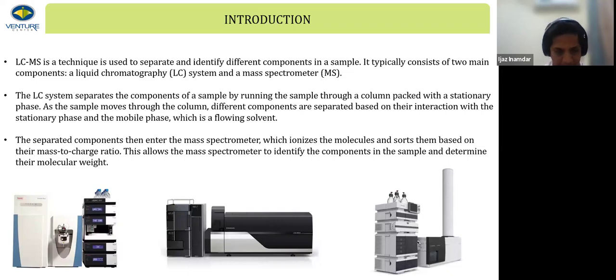So what we literally do is we connect the output of the HPLC to the input of the MS, and that's how the flow is connected, and that's how we get some mass spectrum.